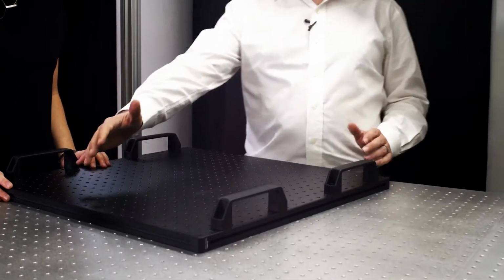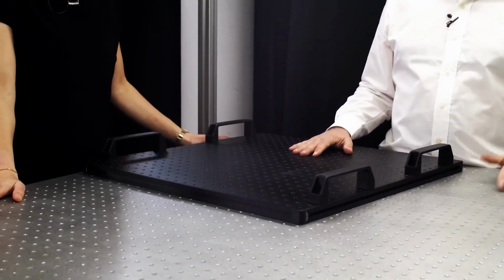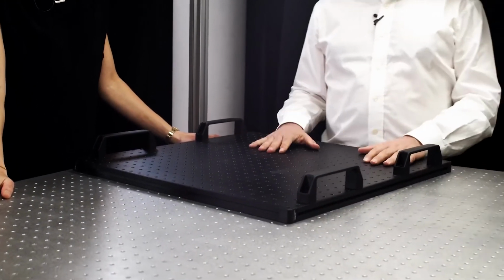OK, so this is the optical breadboard that we're going to ship with every system, actually. It's 600 by 600 millimeter. If you have your own optical breadboard, it's also fine. We can fix it there. But typically, that's how we're going to ship our multiphoton microscope with it. And so we're going to put here the Zebra stages.